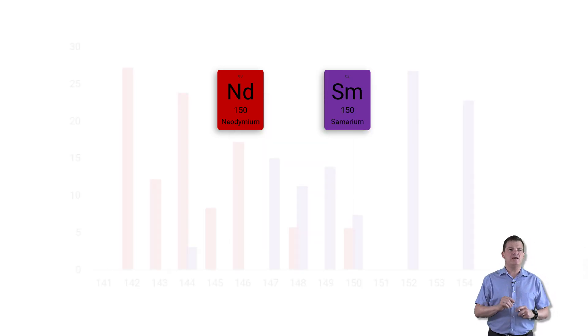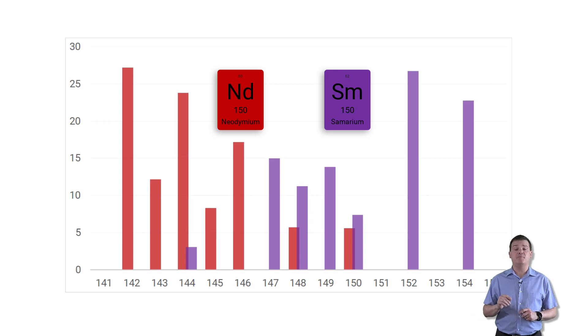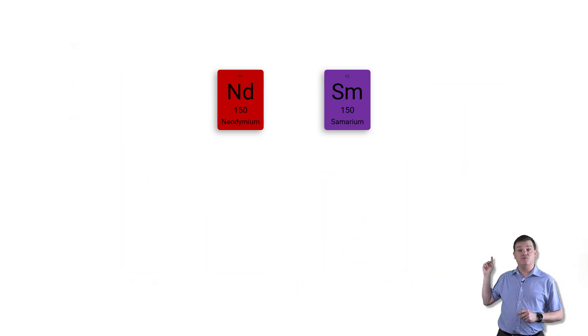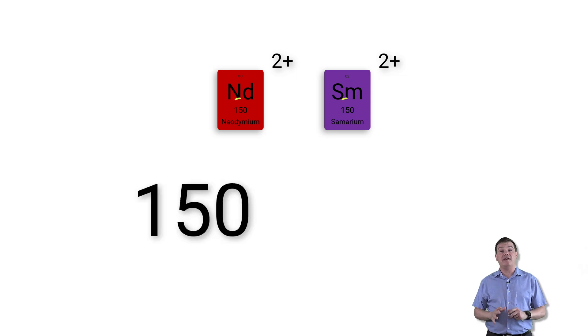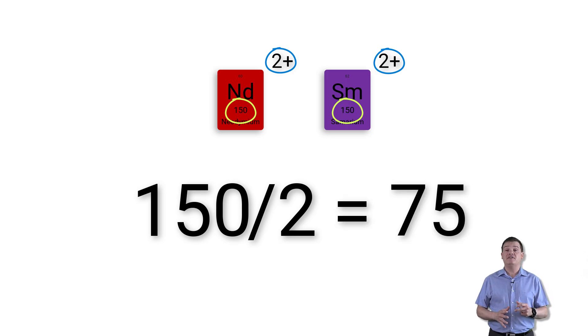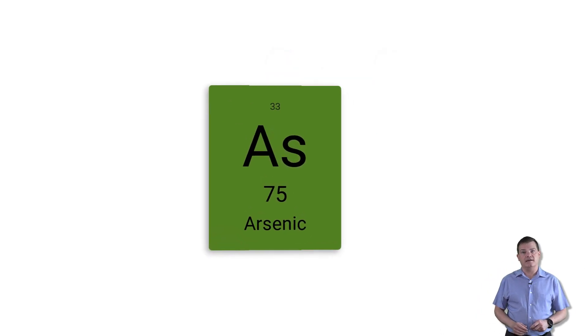Now both neodymium and samarium have an isotope at mass 150. If the neodymium and samarium atoms lose two electrons in the plasma they'll form ions with a two plus charge. A quadrupole separates ions by their mass to charge ratio so a doubly charged ion appears at half of its true mass, that is mass 75, the same mass as arsenic.